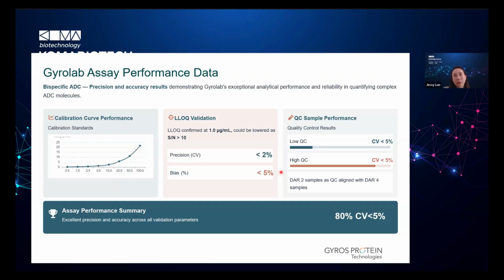That means the assay is not quite robust and the data are not quite good. In these cases, Gyrolab can support it better than other platforms, because the low affinity problem is sometimes maximized by the matrix effect. If you solve the matrix effect issue, then the data could be better.